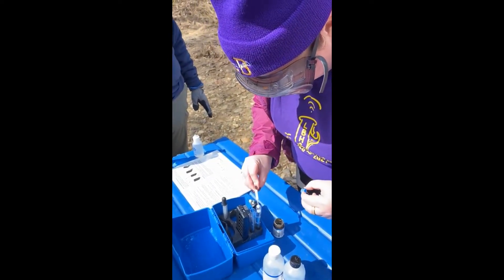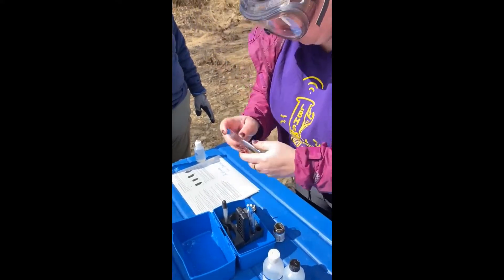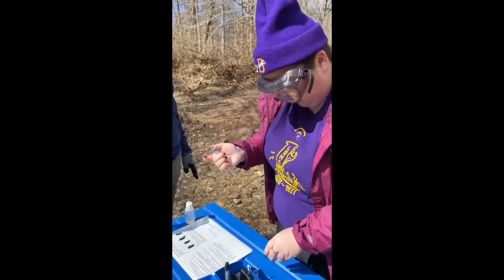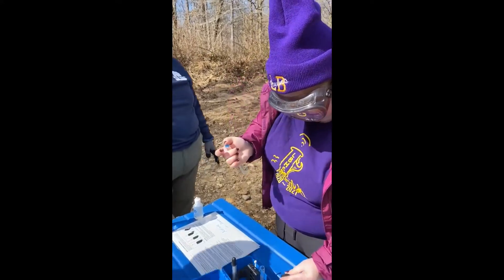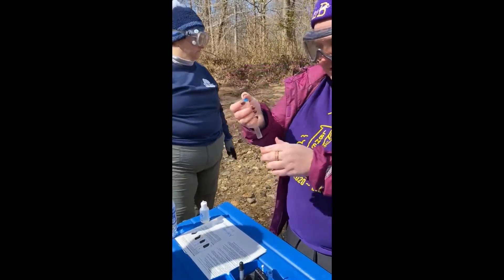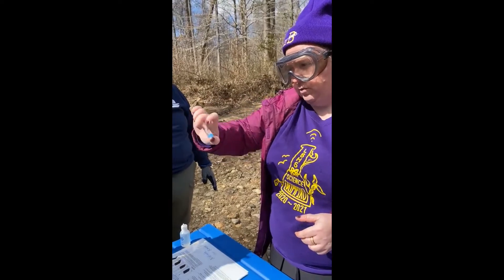Avoid any excess. Now I'm going to mix it 30 times in one minute. We're going to mix this and let it sit for 10 minutes and then we will come back and do our final reading.